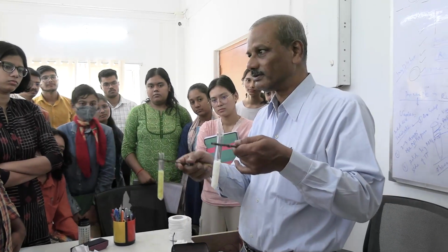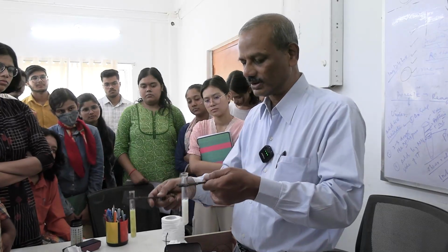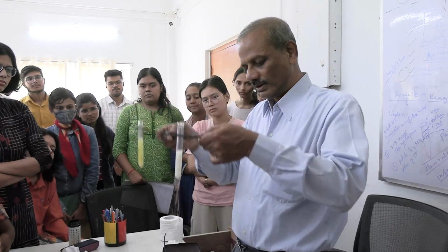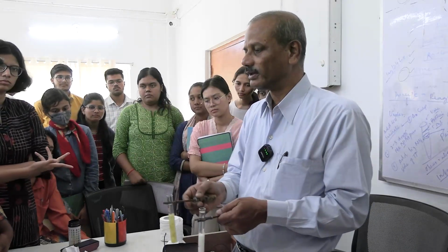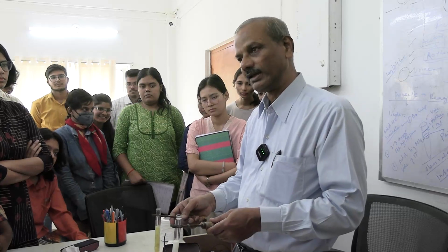So somebody has to mix this part. Those who will be participating, let them do this. I want them to do this job. So 2 polysaccharides I have brought, 2 disaccharides I have brought, monosaccharides I have also shown already, and we will be doing monosaccharides, and vitamin C I have brought, fruit I have brought. Has anybody brought any other sweet fruit? Nobody has brought, so I could not show it to you.